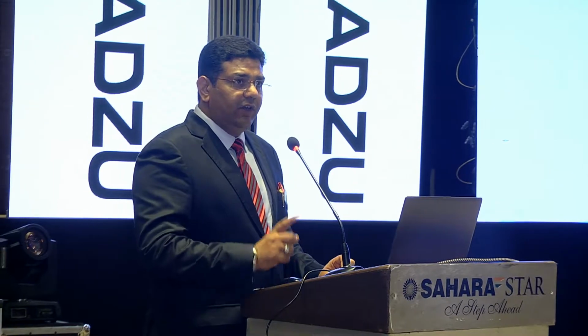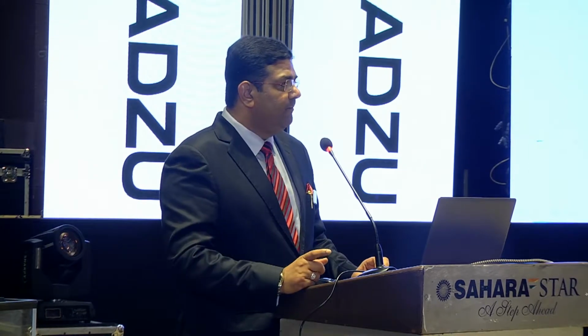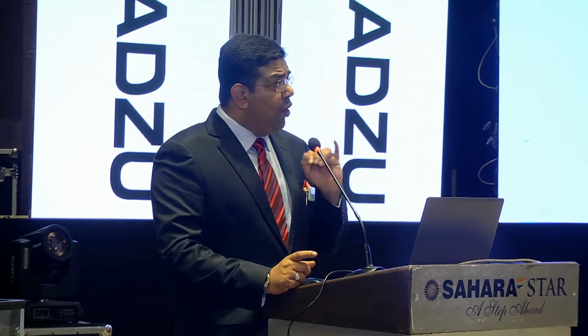We lost the order because it was not CFR compliant. It was a huge order. So then Shimadzu took it seriously and they developed the Lab Solution software and the super micro weighing balance, Stablo AP. Nobody in the world has got Stablo AP.